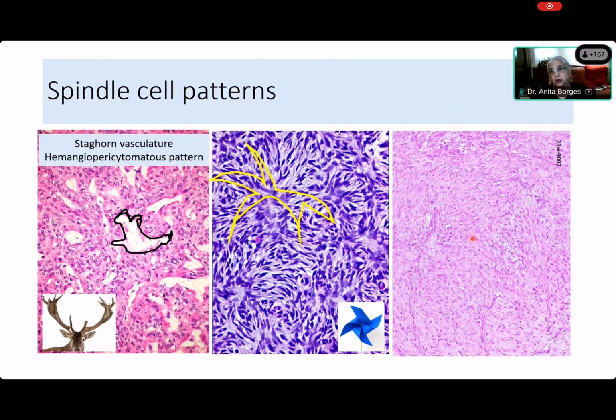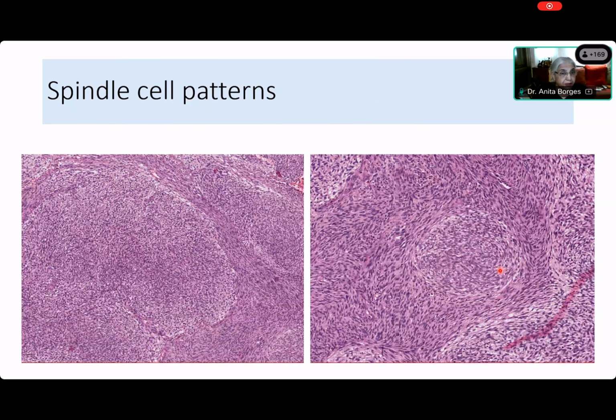Now who's there next? Elsa, you want to tell me what pattern do you see here on the next? Haphazard pattern. What pattern did you say? I didn't hear you. Haphazard pattern. Yes, there's no pattern to be seen at all. You see lots of spindle cells, but they are placed in a haphazard pattern. Very good. So that is storiform. This is haphazard. Excellent. So now all of you are getting very good at looking at patterns. Priyamada, what is this pattern?